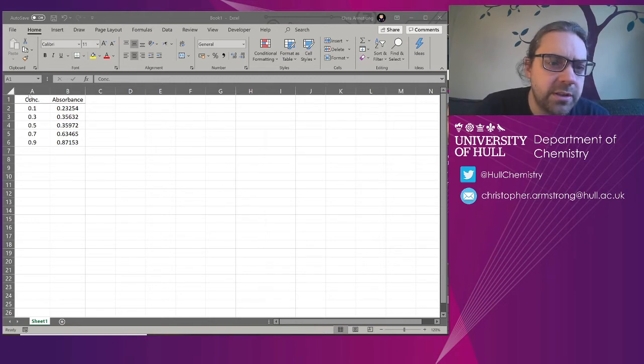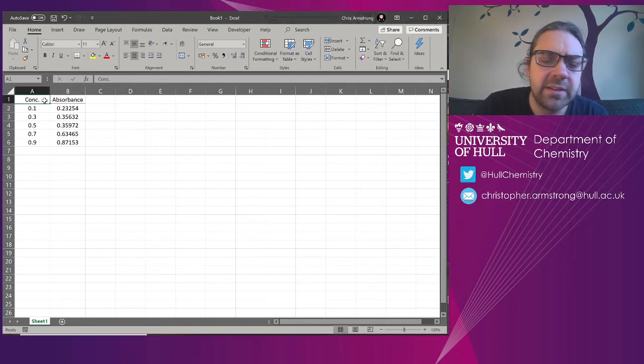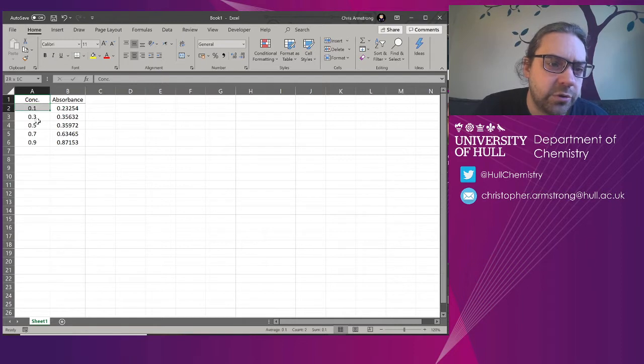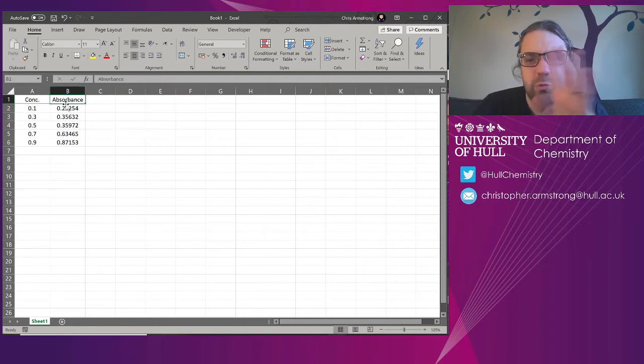I've got something that, let's make this say it's a calibration graph. There's a concentration and absorbance.